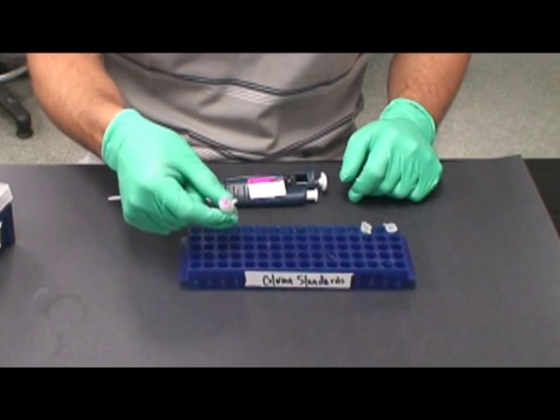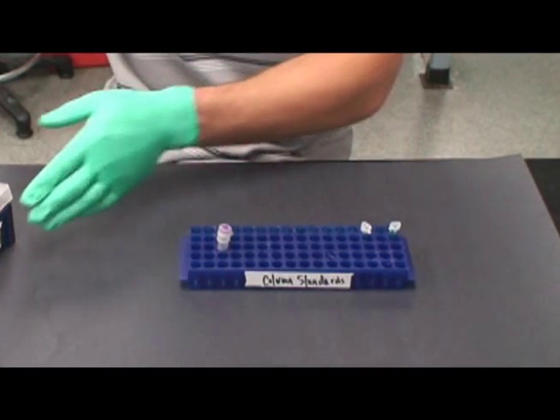Next, add 2 microliters of 10x fast digest buffer into both tubes.